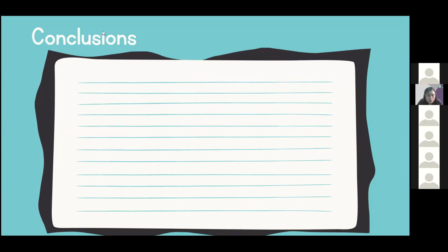We have also just realized that there is such a thing called gravity and vacuum filtration, and it is new to our vocabulary. We were also amazed at how the crucible and cover resisted the heat while its appearance is just like a glass we use in the kitchen. Well, it is not called heat resistant for nothing. In this activity, we have also tried creating and folding a filter paper with the guidance of the video link that was provided. So far, it was really easy and simple to follow.